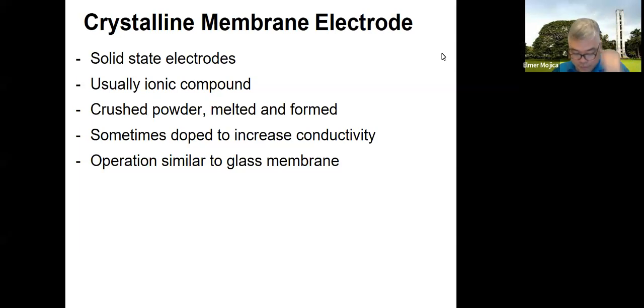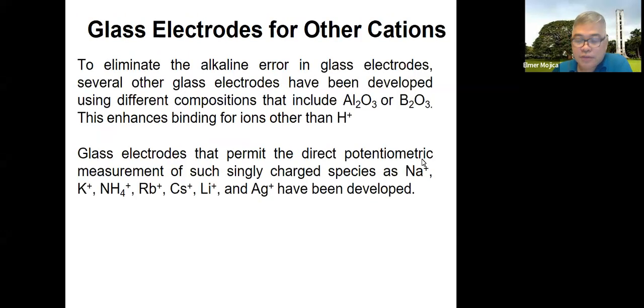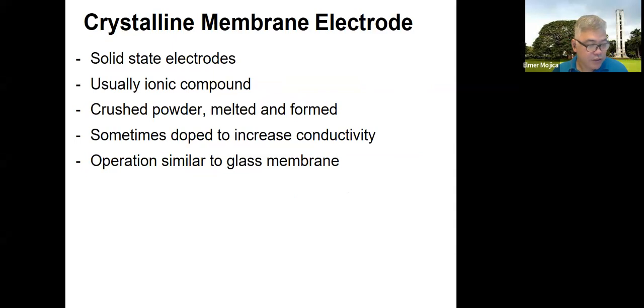So hopefully we can finish potentiometry and then go to colorimetry next meeting. I know we worked on glass electrodes last time, but I'm not sure if I went over the crystalline membrane electrode.